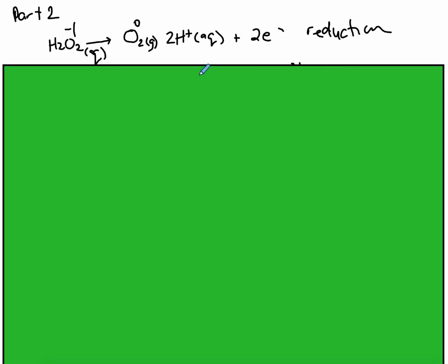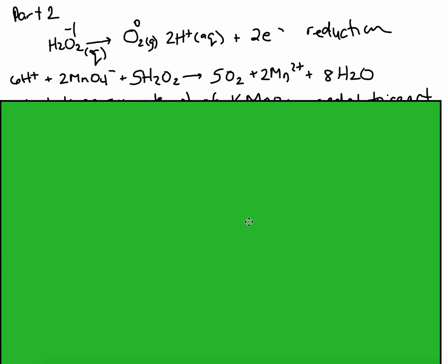So you'll probably see some bubbles of oxygen being formed when you do this. Hydrogen ions are present. We've also got the sulfuric acid. Everything stays the same in the lab, except you're not using the ferrous ammonium sulfate. You're using the hydrogen peroxide and then 2 electrons. Once again, I have my little box to guide us step by step.